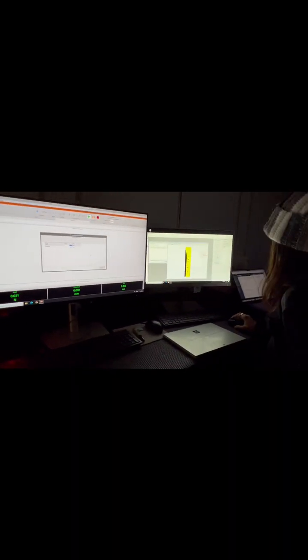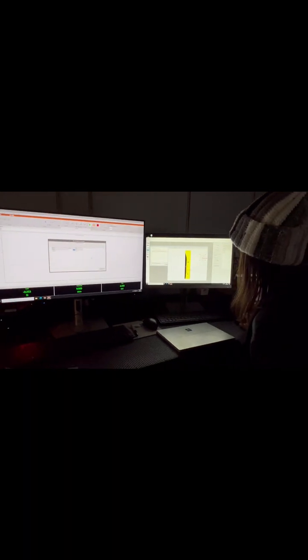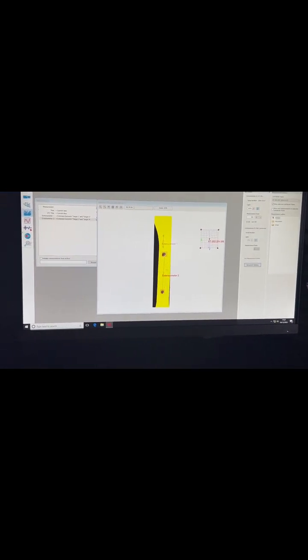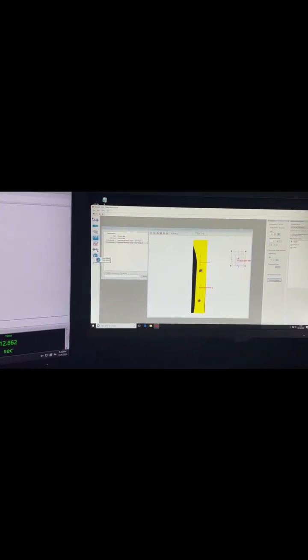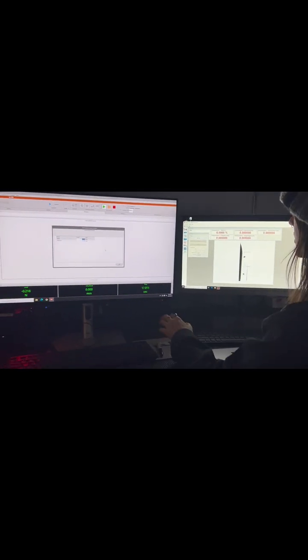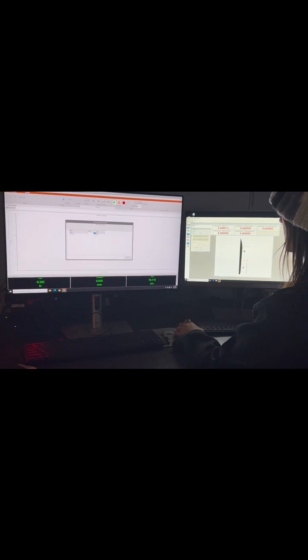And this one is ready to go. So in regards to the MTS software, we need to track these 2 black dots. So we're going to put these boxes over those 2 black dots and go to start testing. And now we're ready to go for both. And we need to click both at the same time. So I'm going to do that right now.